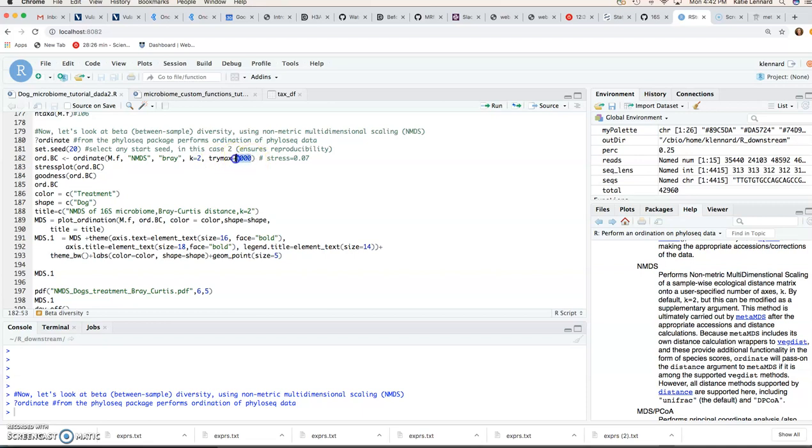And then trymax is the maximum number of iterations that you specify for your NMDS. So remember this is a random start seed. So we're going to set seed to 20 here just to ensure reproducibility. You can choose any number.